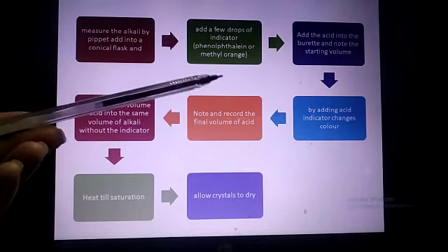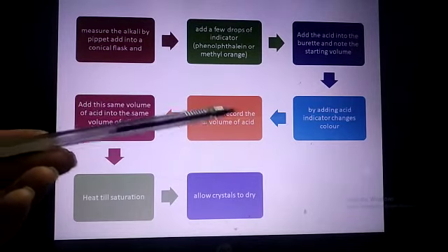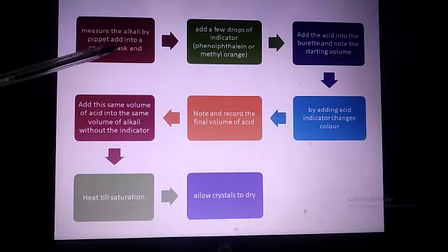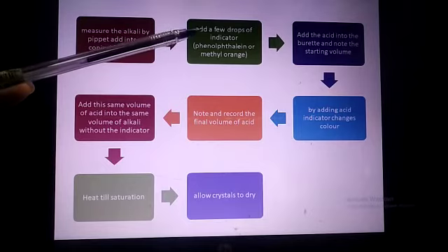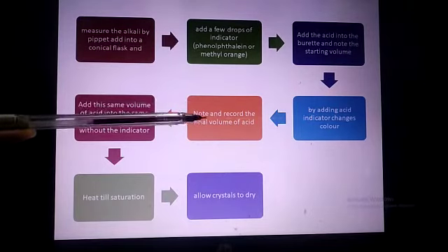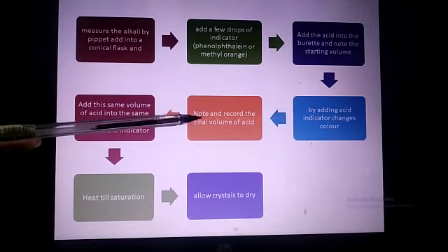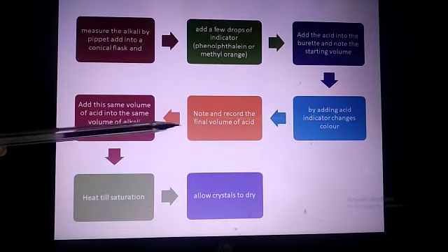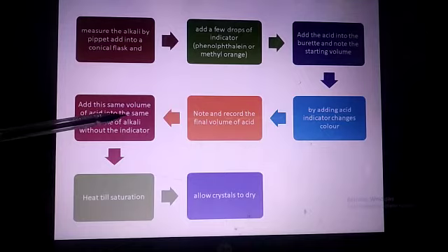Add acid into the burette and note the starting volume. By adding acid, the indicator will change color because we added acid to the alkali. Then note and record the final volume of acid - this shows how much acid is required to neutralize the base.